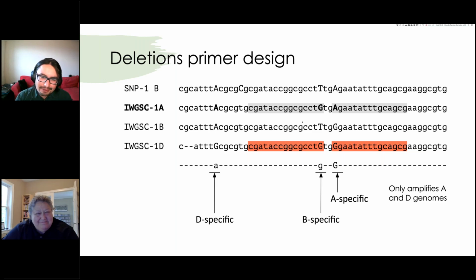So in principle, you just need to install it in your computer. It's a command that you can run on the command line. So if you have basic bioinformatics knowledge, it should be straightforward. It is documented on the website, or I'm finishing the documentation on the website and adding some examples there. But of course, I'm biased. I say it simply because I did it. But I try to make it as easy to install as possible.